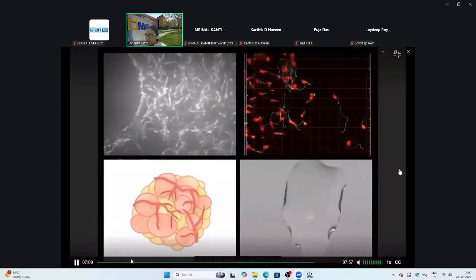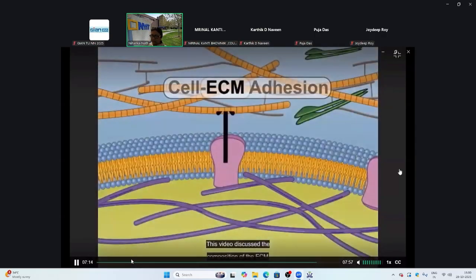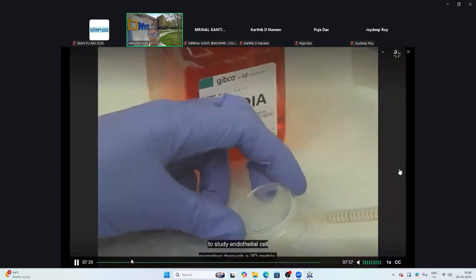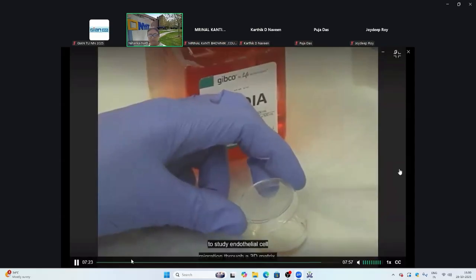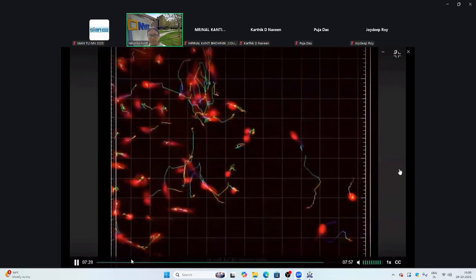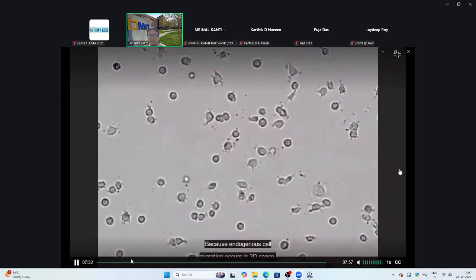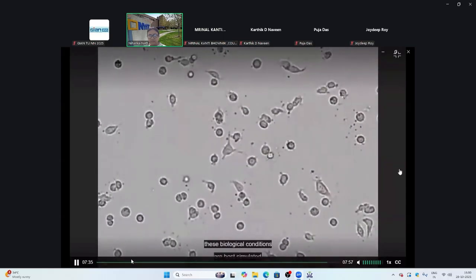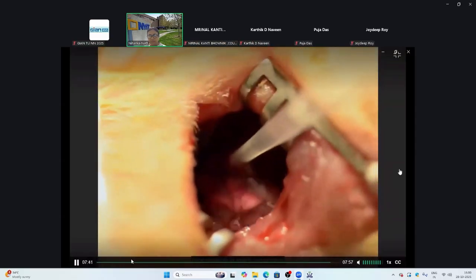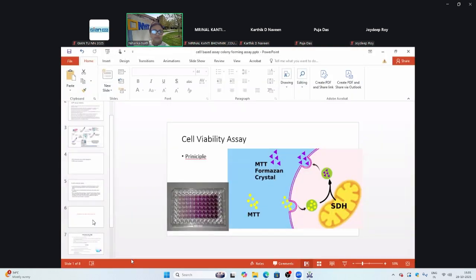You've just watched JoVE's video on extracellular matrix invasion assays. This video discussed the composition of the ECM and how cells migrate through it, presented a simple protocol to study endothelial cell migration through a 3D matrix, and highlighted several cellular processes currently being studied in the context of cell-ECM interactions. Because endogenous cell migration occurs in 3D space, these biological conditions are best simulated by 3D culture techniques. Improvements in matrix composition will continue to allow scientists to more accurately replicate and study cellular migration in the lab.